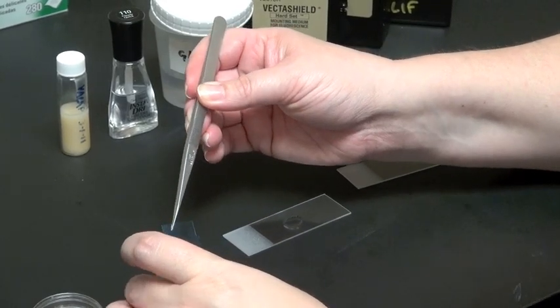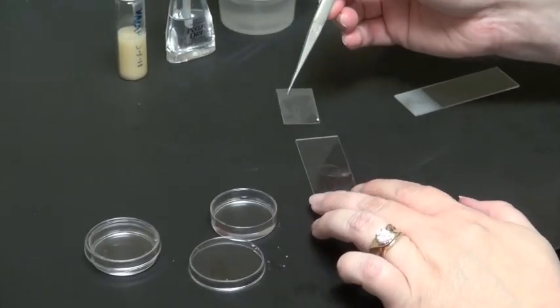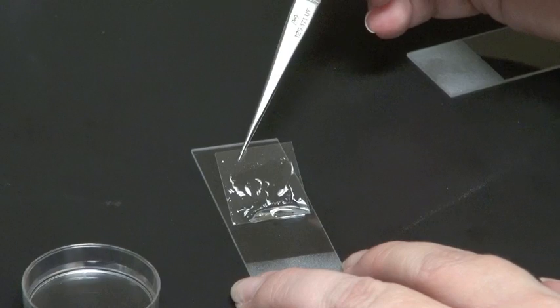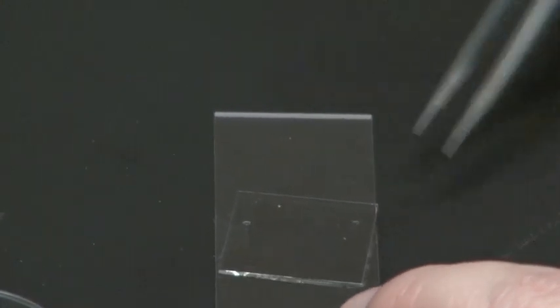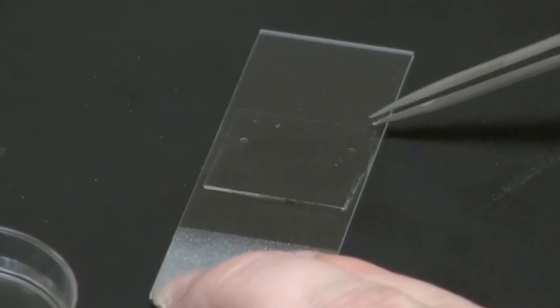So we'll grasp our cover glass, and then we're going to position it with the edge just touching our mounting media. Then you want to slowly lower it down and gently let it fall so that you don't get a lot of air bubbles in here.